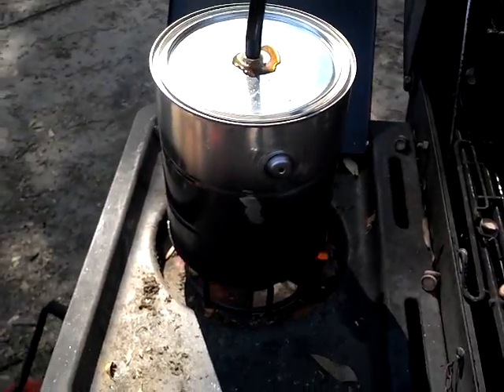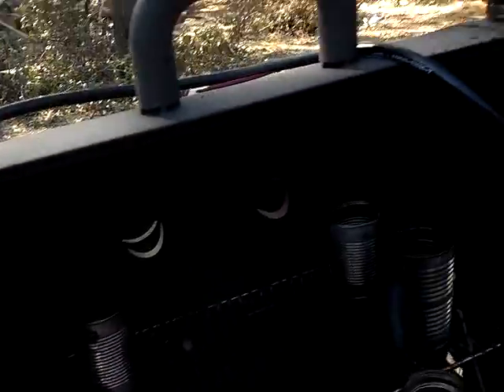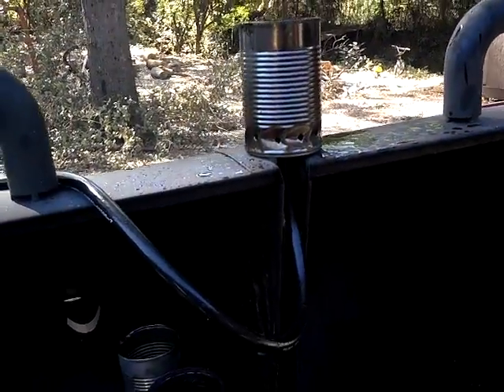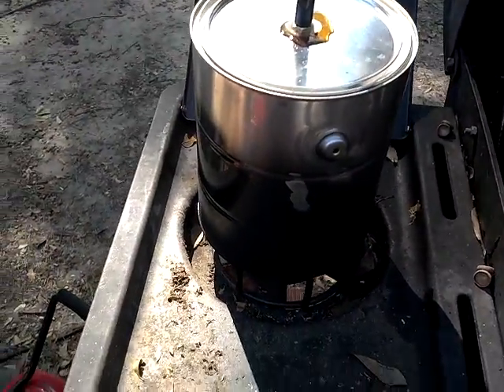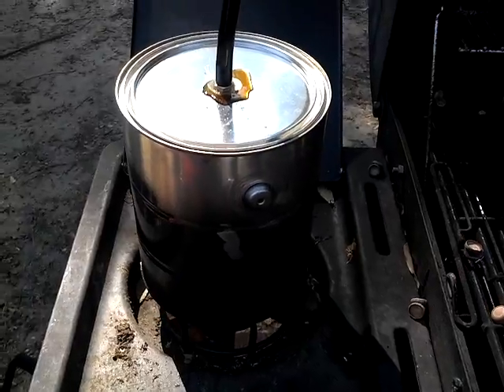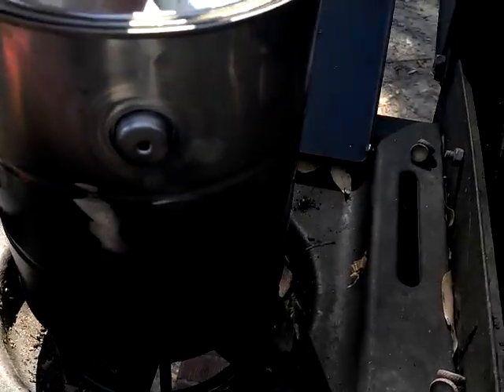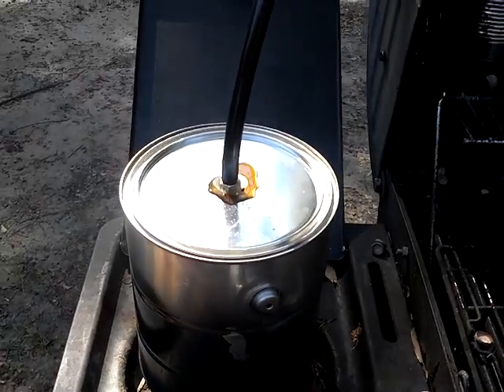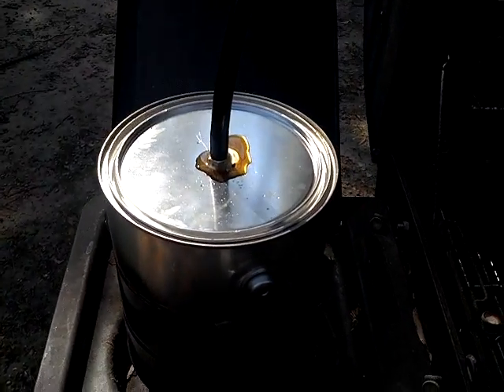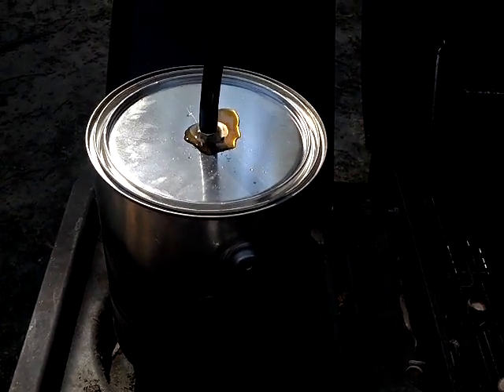This is just a normal paint can I got from Lowe's. There's about a half a gallon in there or so. I was going to do more than that, but I'm kind of glad I didn't, because I probably would have had a bigger situation. I don't have hose clamps on there.